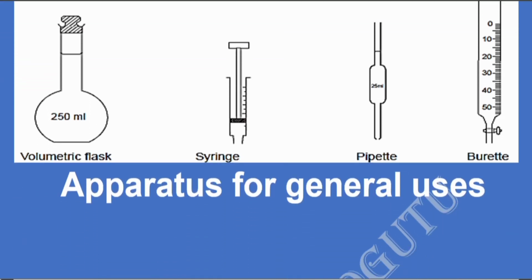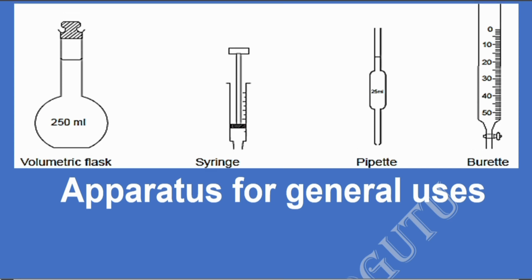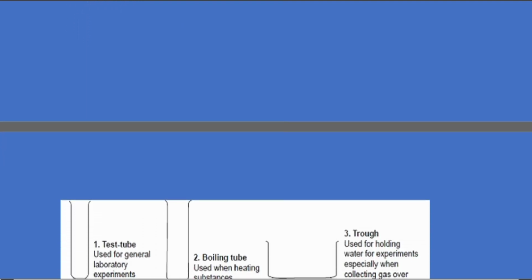Then apparatus for general use. The other ones have been for measuring the volume. Now we have the apparatus for general use. Let's see these apparatus that are for general use.